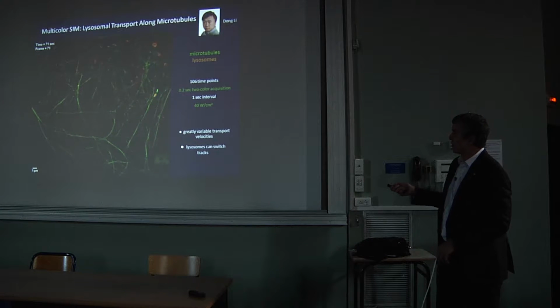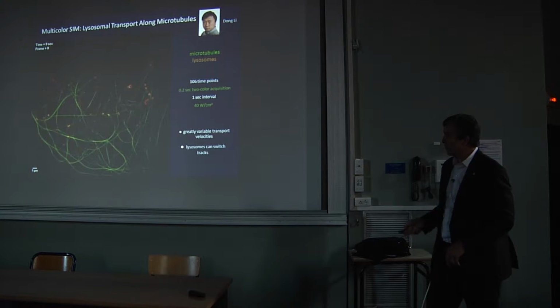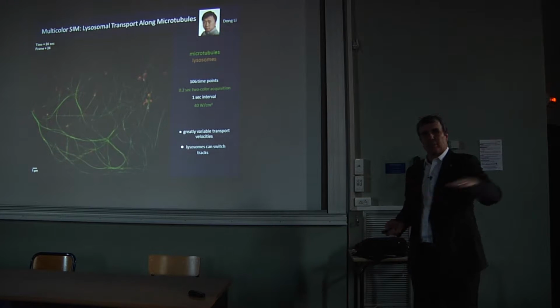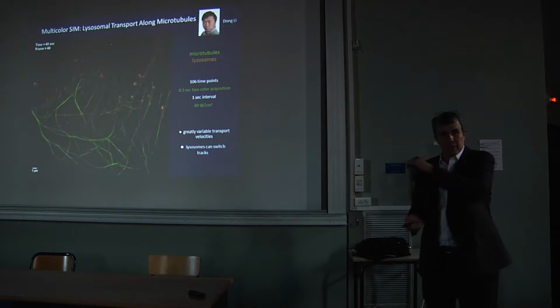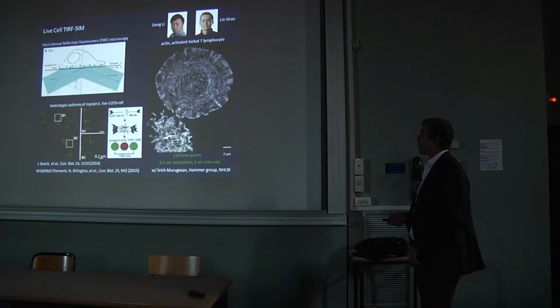And you can watch these lysosomes as they track along and then switch tracks, like switching train tracks, and go on other microtubules. Sometimes they stop and sometimes they move like a bat out of hell when there's molecular motors there to really pull them along.